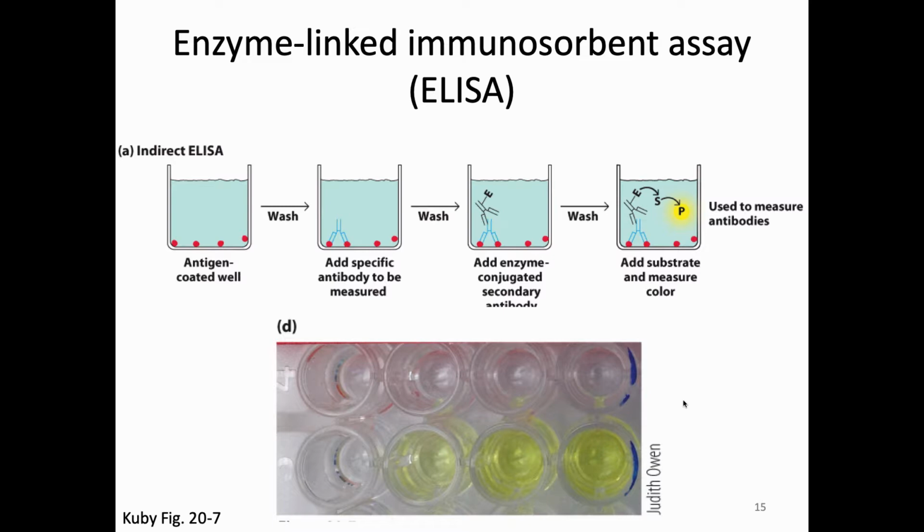And so you can also detect presence or absence of antibodies with an ELISA, in addition to detecting presence or absence of antigen. There is also a way to do some quantification with this type of ELISA. All right, so these all are sort of things that seem pretty straightforward, things that are sort of related to things you've done before.